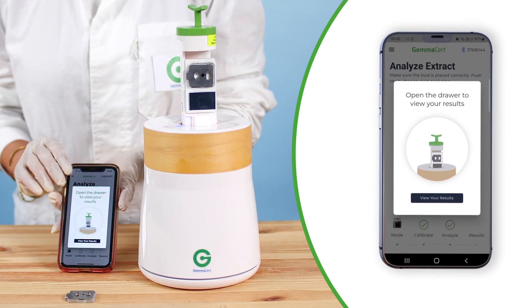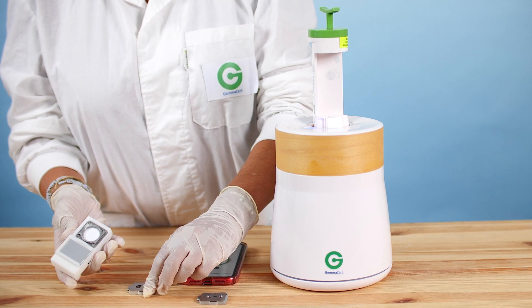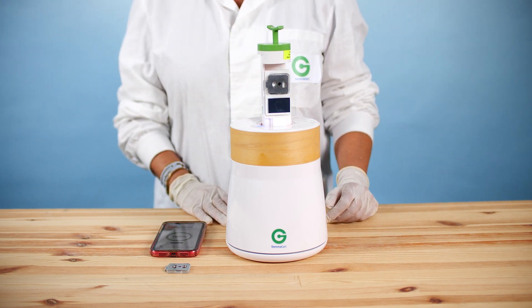Pull the drawer out and then press OK. Replace the empty blister pack accessory with the extract-filled blister accessory. The blister should be filled to the top, avoiding any air gaps. Wipe off any excess extract which may have spilled when closing the holder.